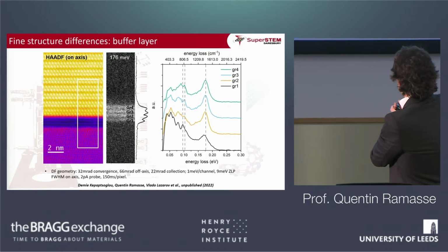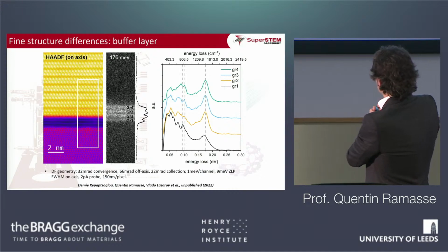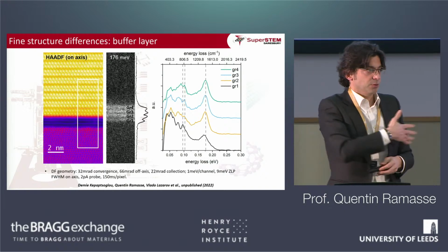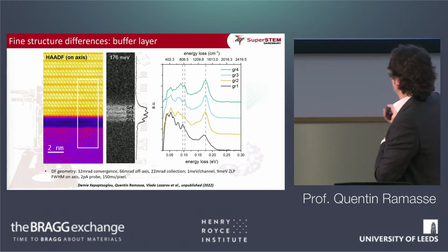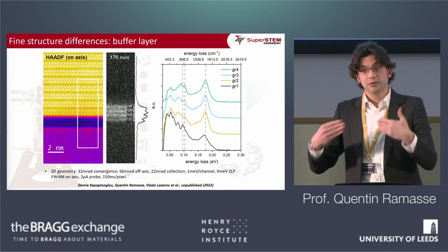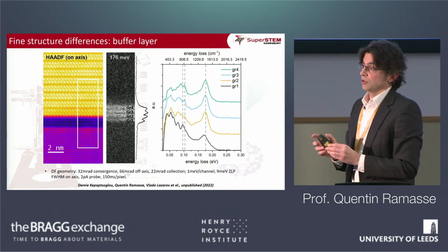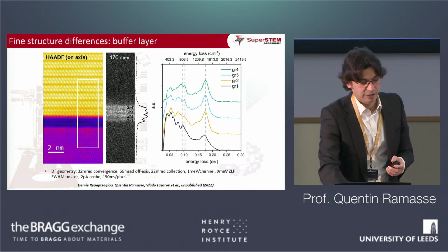And so what you're seeing here, especially that shift towards lower energy losses of the modes that correspond to graphite, this is not because we're picking up something else from somewhere else. This is really a defect mode that is induced by the fact that this layer sticks down, and you're really seeing a different vibrational response from the bonding of just a few sp3 bonds compared to the normal sp2 bonds that you would get in graphite.